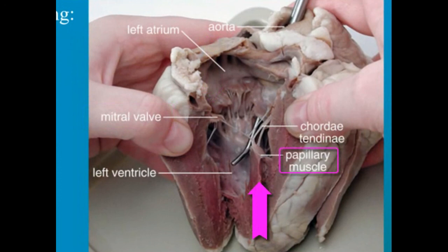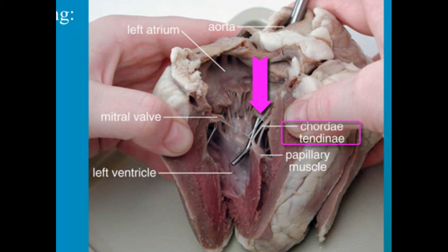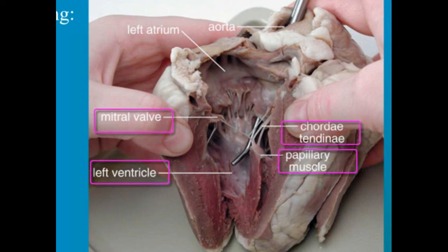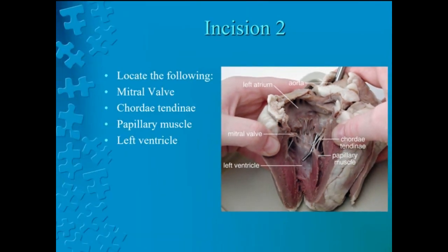The final incision will be through the aorta. Insert a probe into the aorta and observe where it connects to the left ventricle. Make an incision down through the aorta and examine the inside carefully for three small membranous pockets. These form the aortic semilunar valve, which prevents blood from flowing back into the left ventricle. We will pause to make this incision. Locate the semilunar valve and the cusp of the valve.